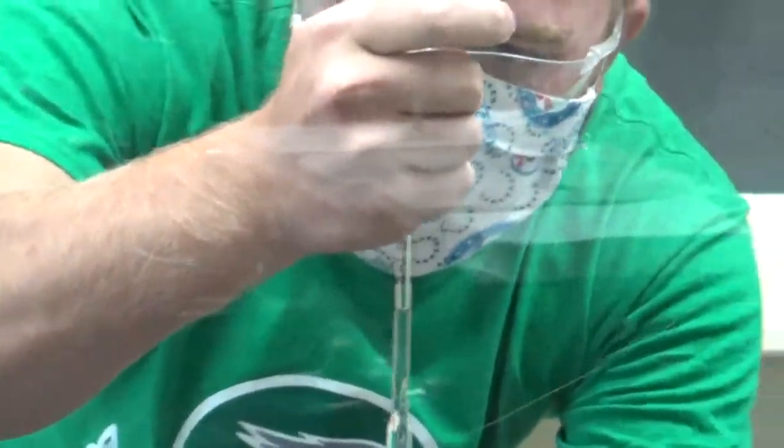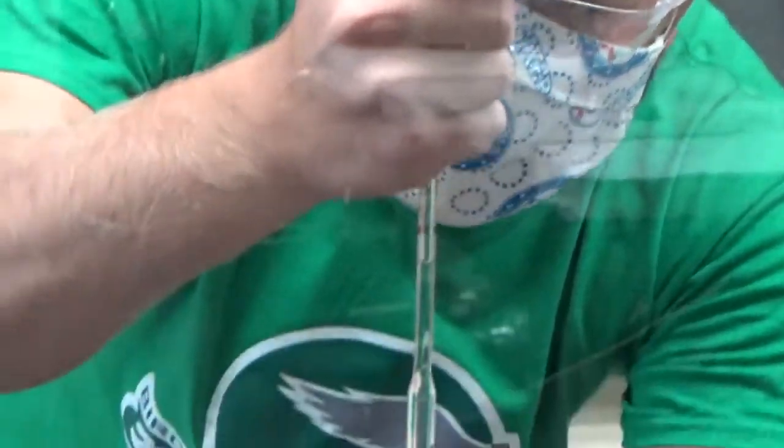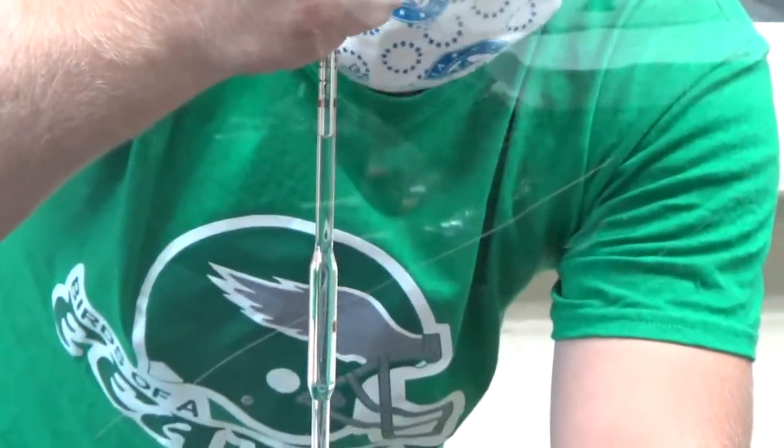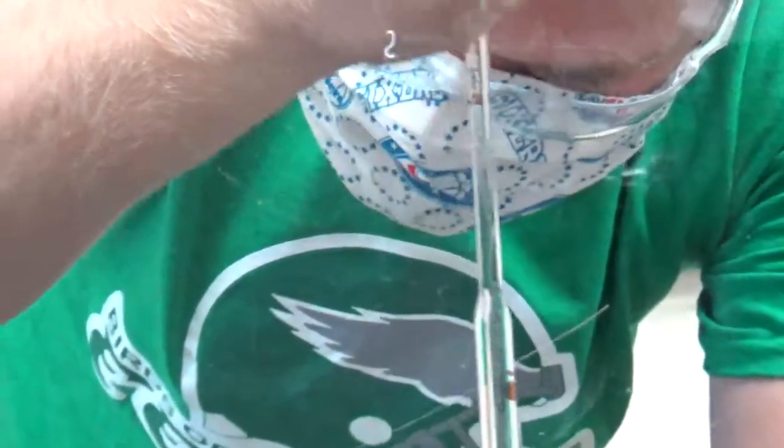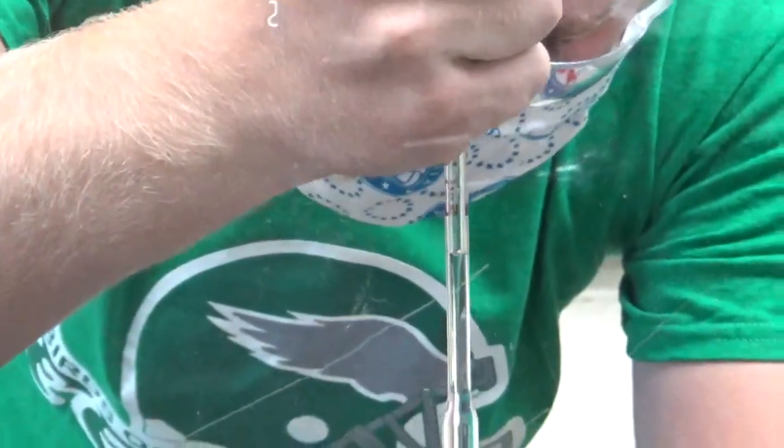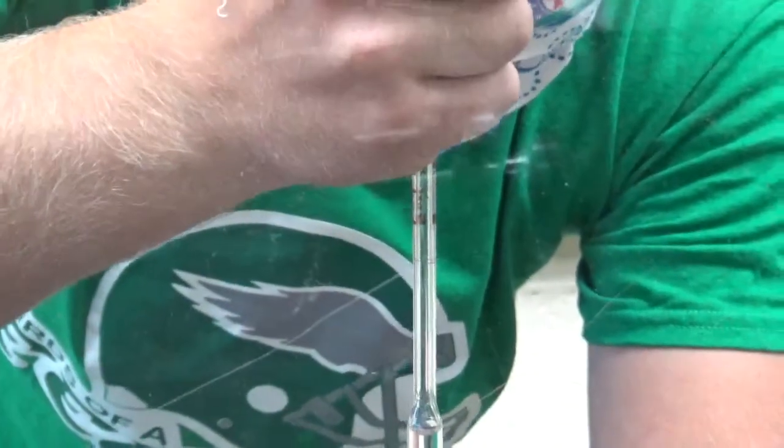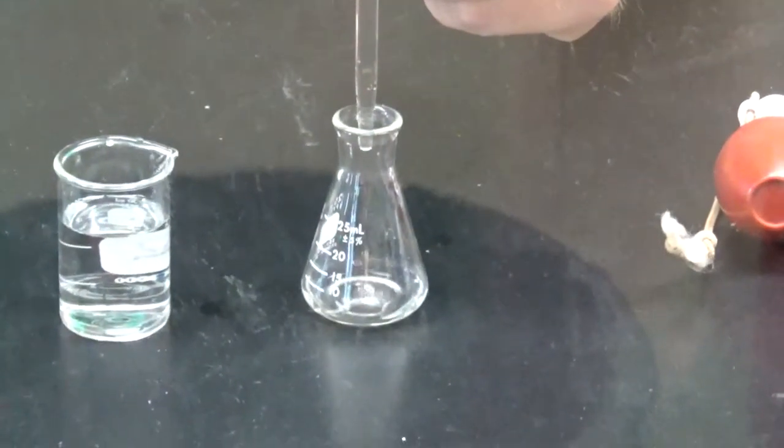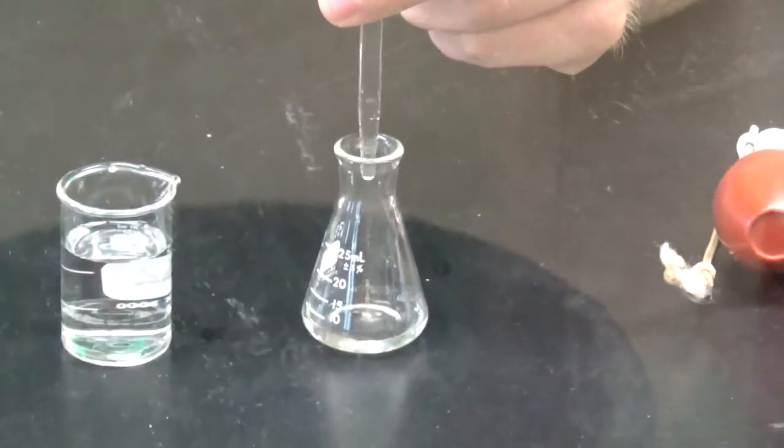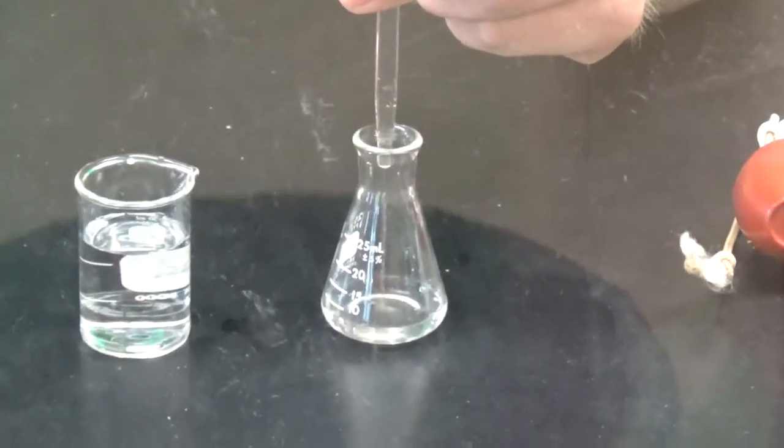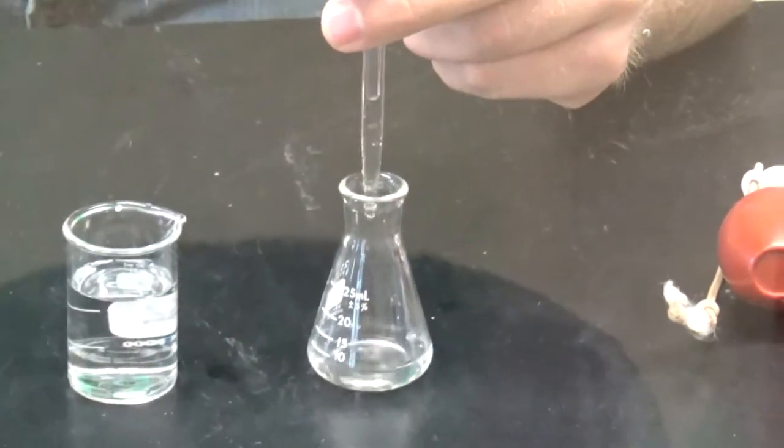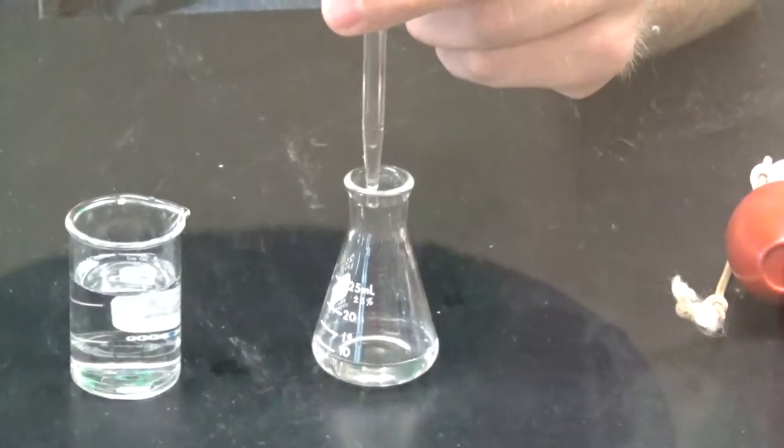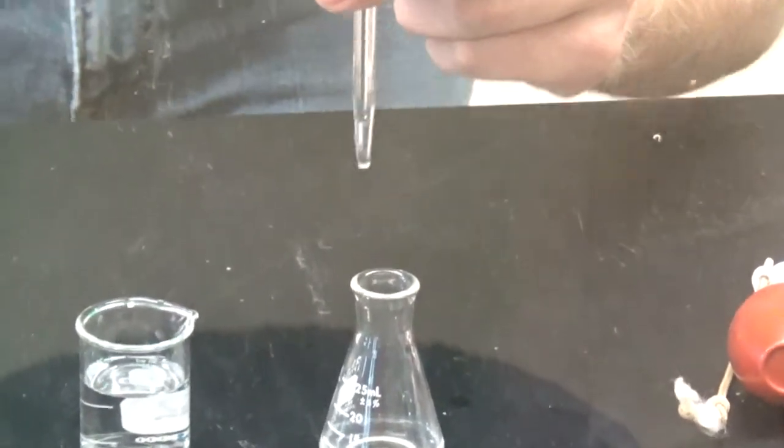You draw the liquid up past that mark and now you try to get the meniscus on that mark. Oh wow, you did it, you got it right the first time. Cool. Now he's dispensing that into an Erlenmeyer flask, which is what you'll do. You'll weigh an Erlenmeyer flask dry and empty and pipette into it. Now he's going to demonstrate how to get that last drop out by touching it to the side of the glass.